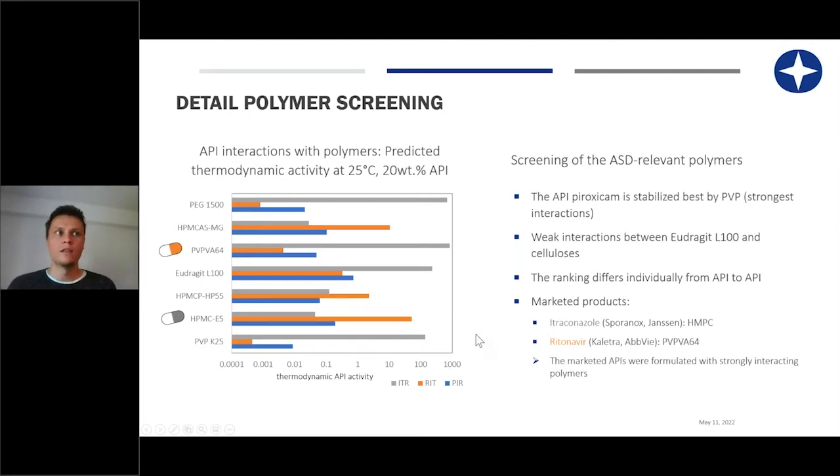But I have to say that the dissolution behavior, for example, also plays a critical role, which is not in the scope of this investigation. What we are discussing here is mainly physical stability against crystallization.